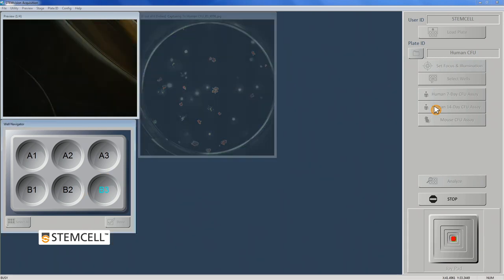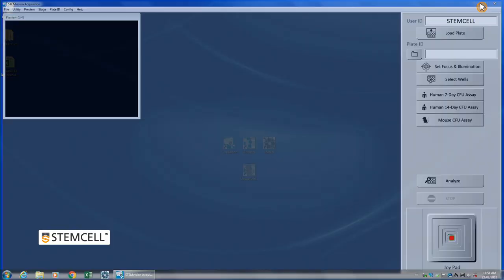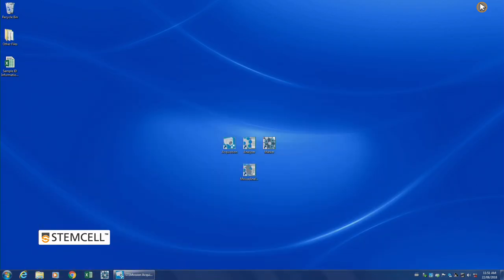Once all images have been acquired, they can be analyzed immediately by selecting the appropriate assay in the Analyzer application or at a later time.